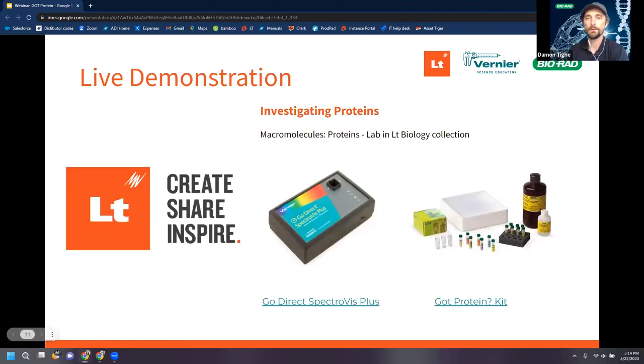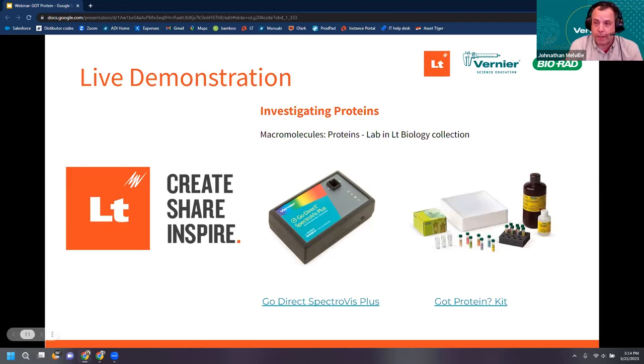I'm going to share my screen now and go into LT to show you the spectrometer and the parts and pieces we'll be using for this lab — just give me a moment.